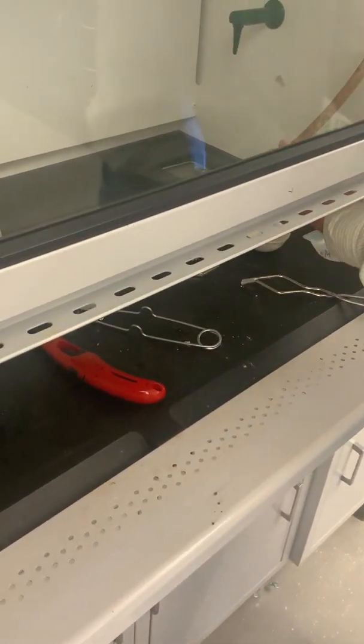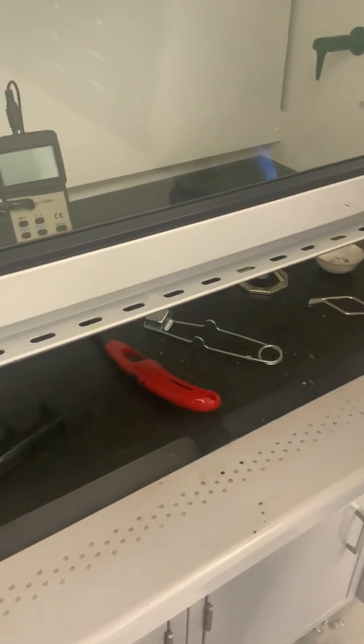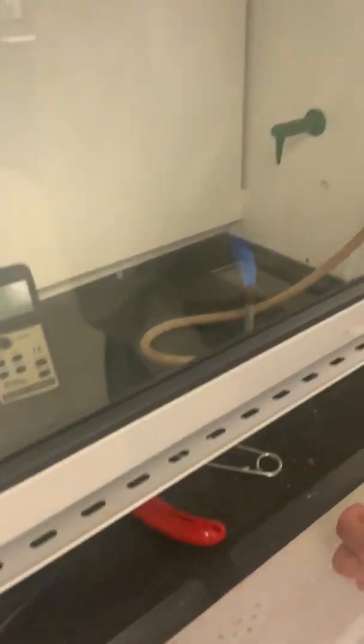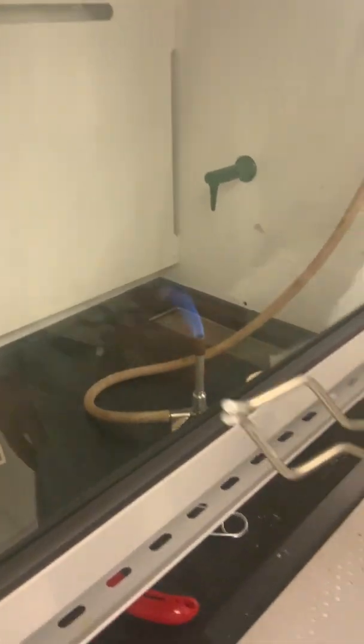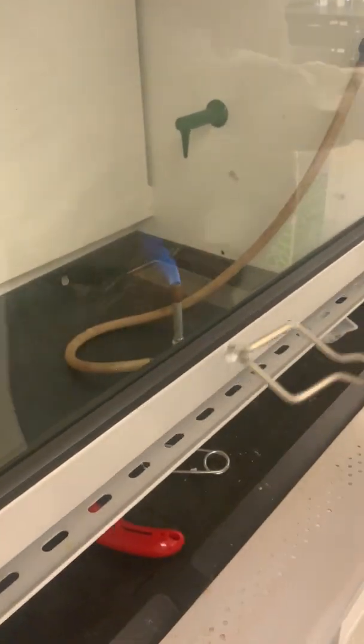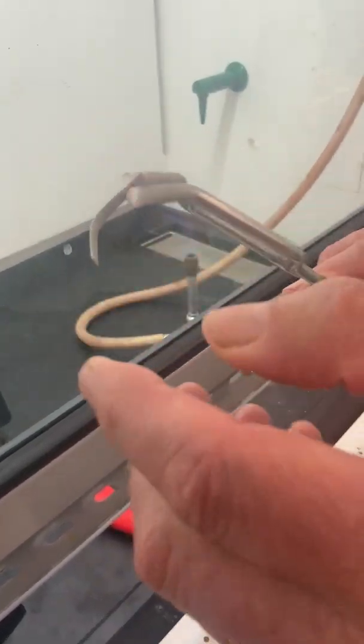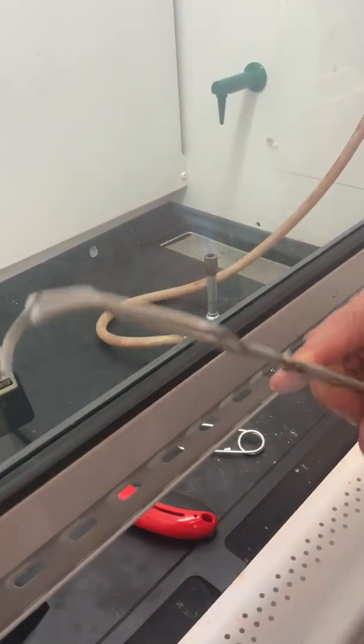So again, how are we doing on time there? Good. Everybody loves this concept of that being immersed right in the flame versus the heating before. The metallic properties of luster and malleability and ductility.